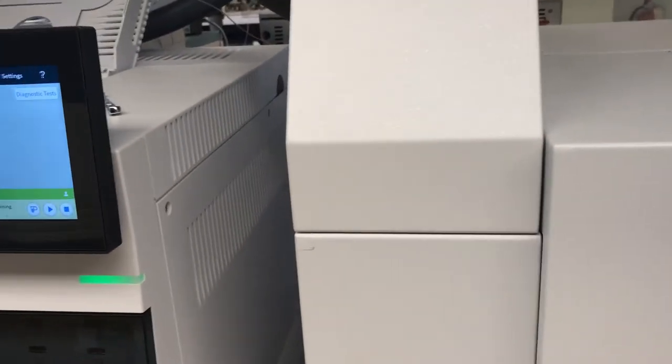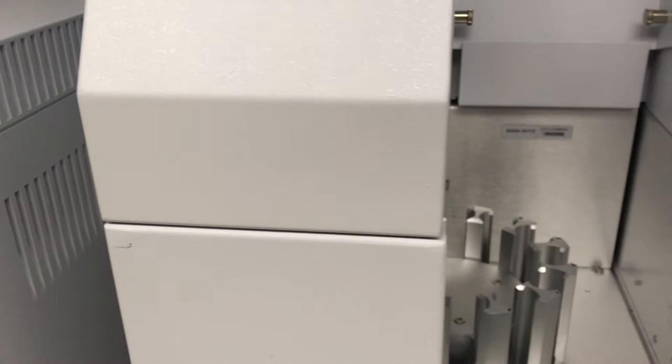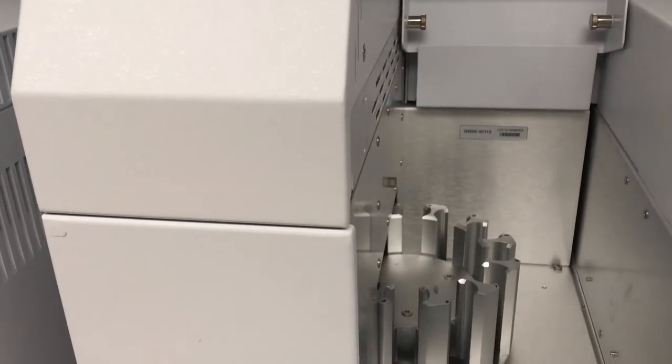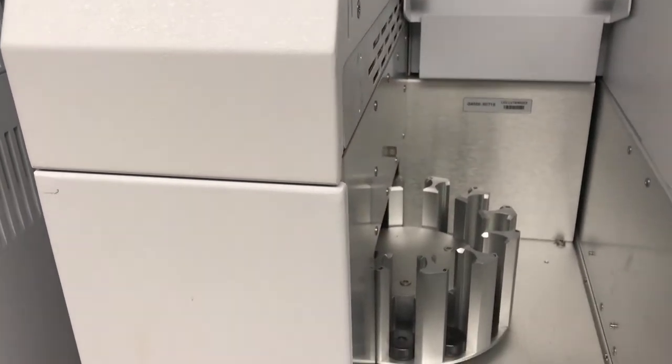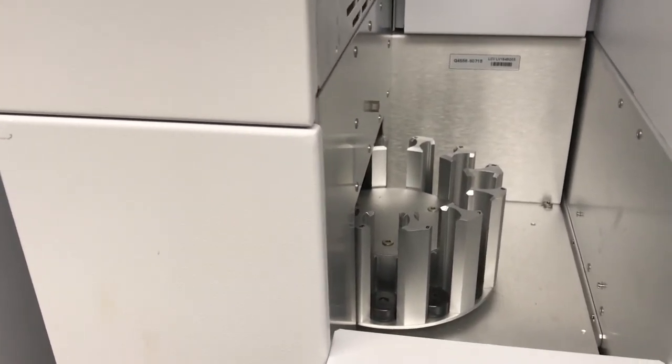So to put the vials in the autosampler, simply find the position that you want to put it in.